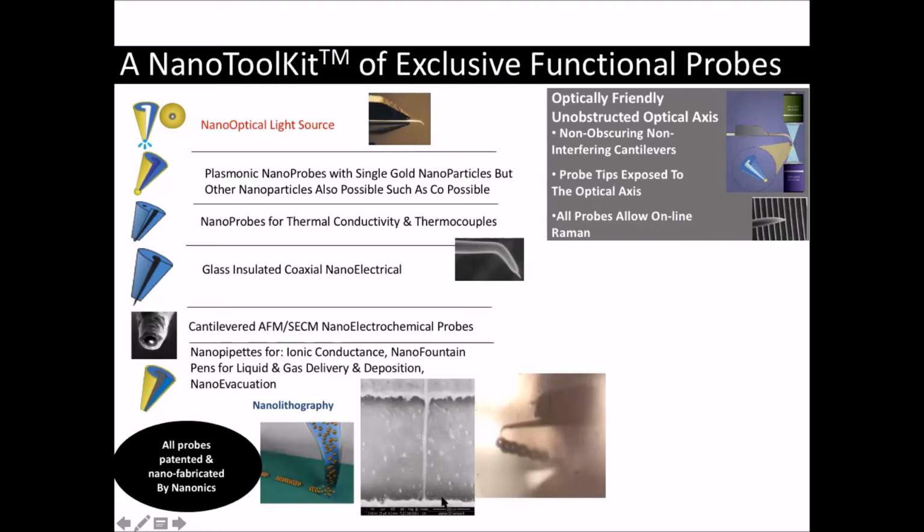When you get the presentation, you'll see this is a 15 nanometer line written with one of these pipettes that has copper formate solution in the pipette. And when it's deposited, the copper is reduced by the formate ion. As a result, you get copper metal between these two contacts. It's a very important methodology. It's called fountain pen nanolithography. It has many, many more functionalities than dip pen lithography. Okay.